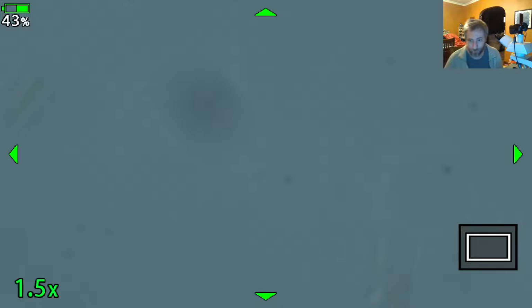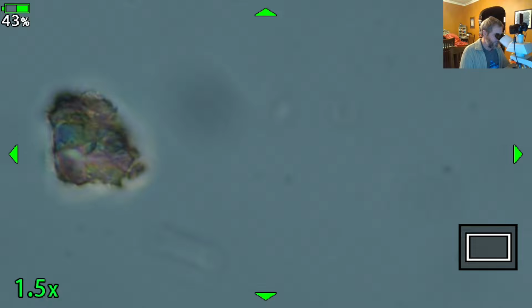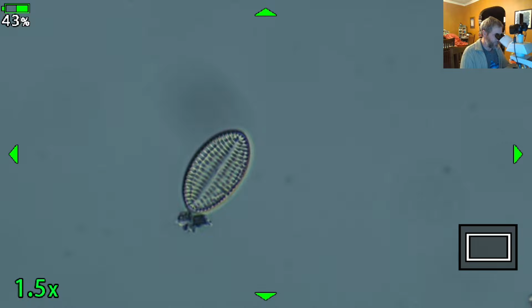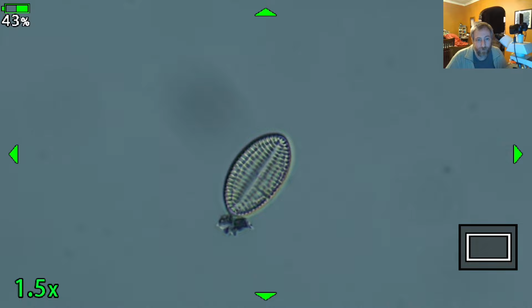It leads to a bunch of different issues, which is that diatoms can get smaller with age, which is the opposite of everything else, although they don't actually shrink. They don't grow, except when they're in that egg stage. They just split, and one stays the same size and one shrinks a little bit every time. So you end up with a size series from the giant baby to the shriveled old man, and the shriveled old man eventually wants to have sex and goes back to the baby. That's basically how their reproduction cycle works. It's a little weird, right? It's kind of the reverse of what everything else does.